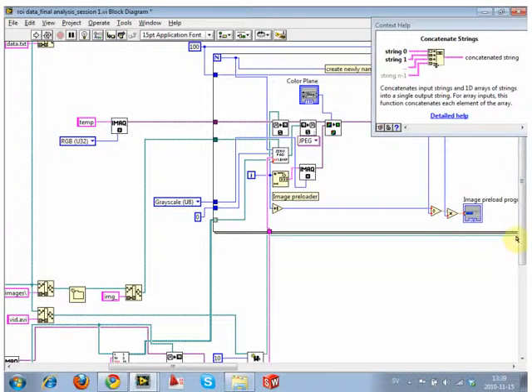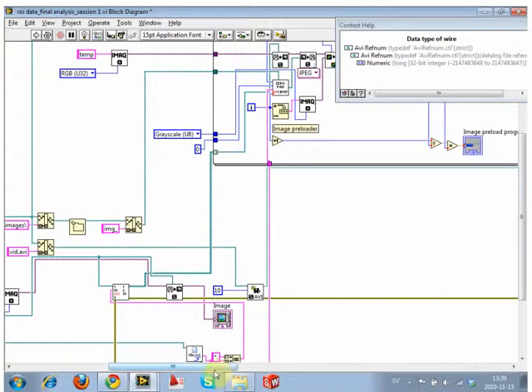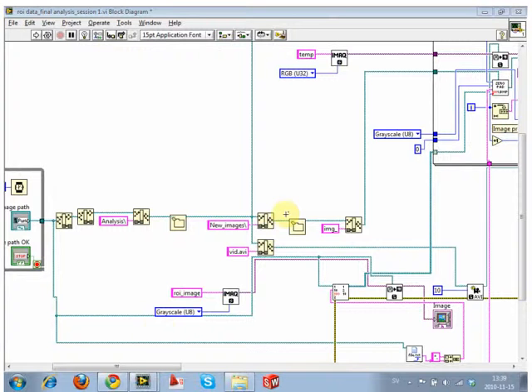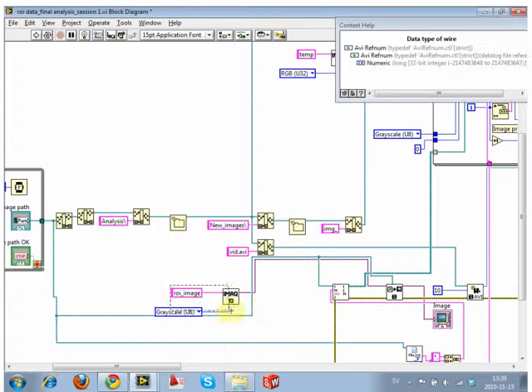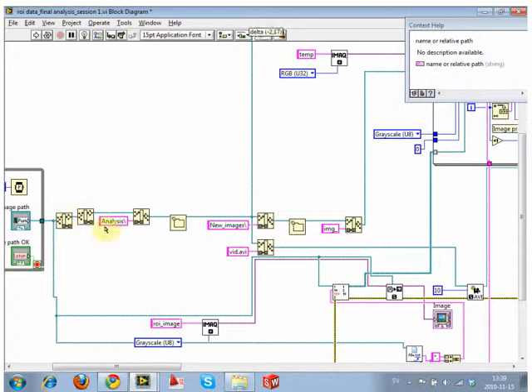Okay, now we've got that started. Let's start destroying this file organizational structure. Let me pull some things down so that you know what we're looking at. If we just look at these string values for now, before I get rid of them.